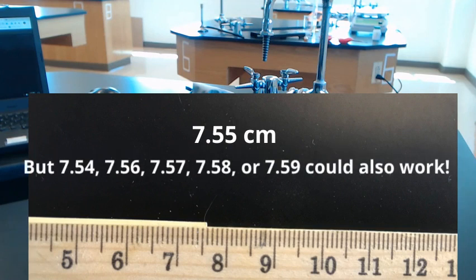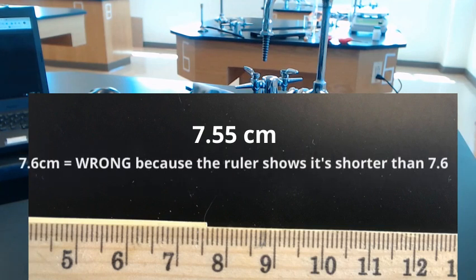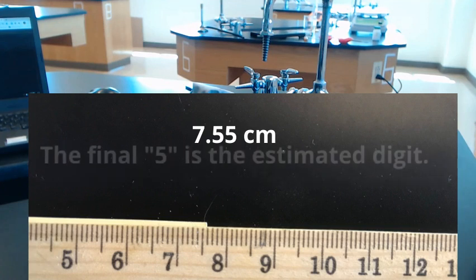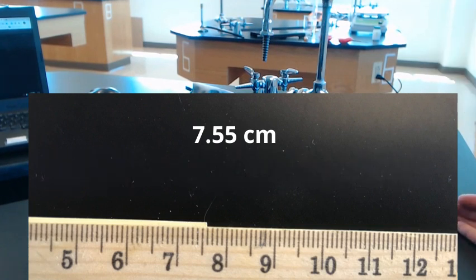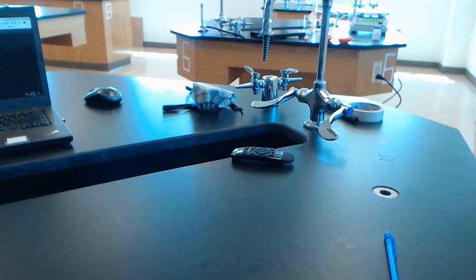All right. I can't leave it at 7.5 because I know for a fact it's over 7.5. I can't put it at 7.6 because it's not there yet. I'm just lying to myself. That's garbage. Okay. So it's between 7.5 and 7.6. Therefore, my measurement is 7.55. That final five is an estimated digit and every scientific measurement needs that. It is not challenging to do because you're just estimating a digit. So you're not lying to yourself when you're writing down your measurement. If you just write down 7.5, that's garbage because you know it's more than 7.5. So you got to write down 7.5 something. So 7.55 is my measurement.